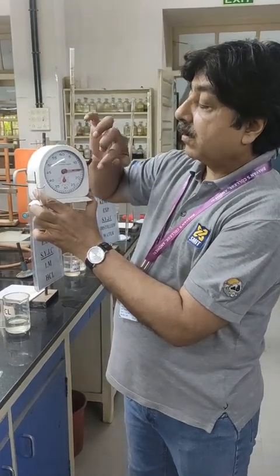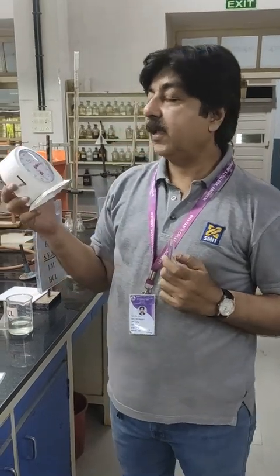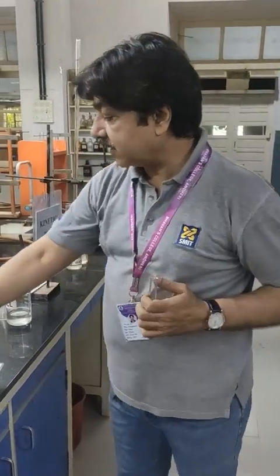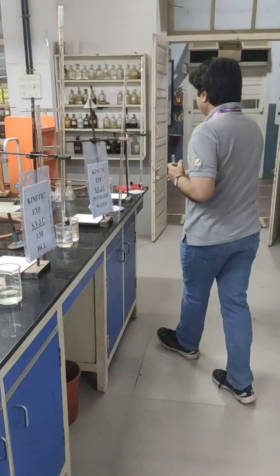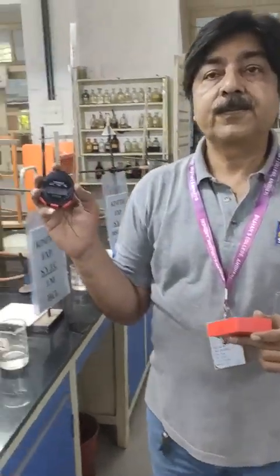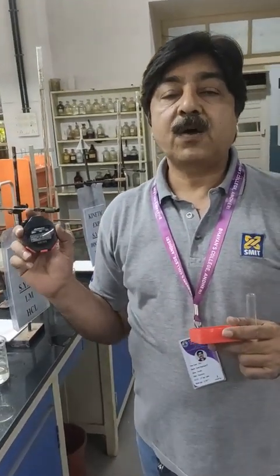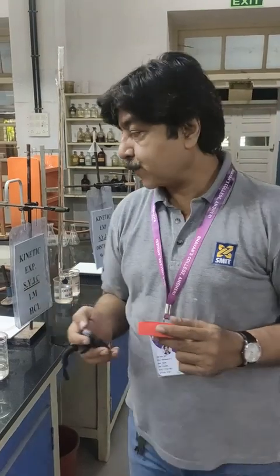Now while recording time, you have to be extremely careful. This is an analog model. Nowadays in the market, we even have digital models of watches. This is somewhat similar to the stopwatch which you have nowadays in your smartphones.